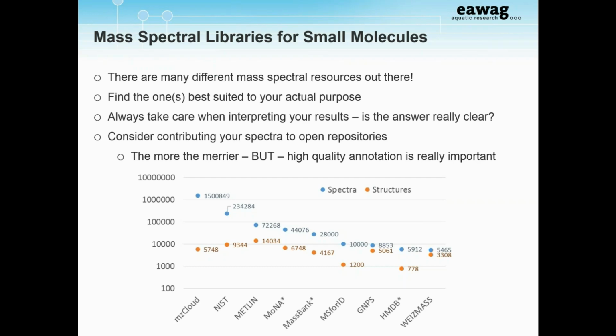Okay. The caveat with that is that you have to be very careful. All of ours are in minutes, and it's actually annotated with minutes. Some of them are just a retention time, and it's not actually clearly annotated as seconds or minutes. So if you're doing a bulk summarizing of MassBank, you have to be very careful with the units.